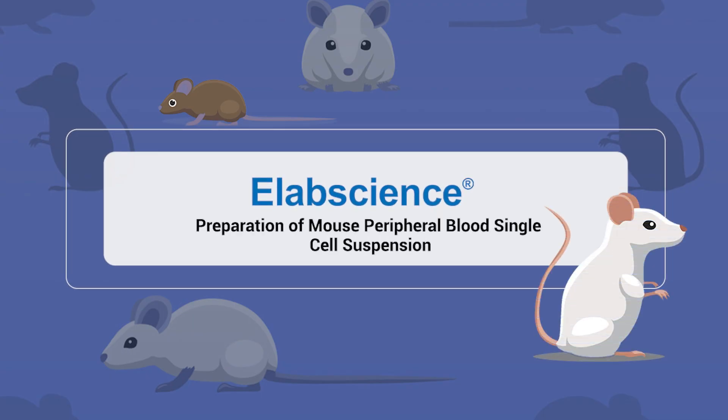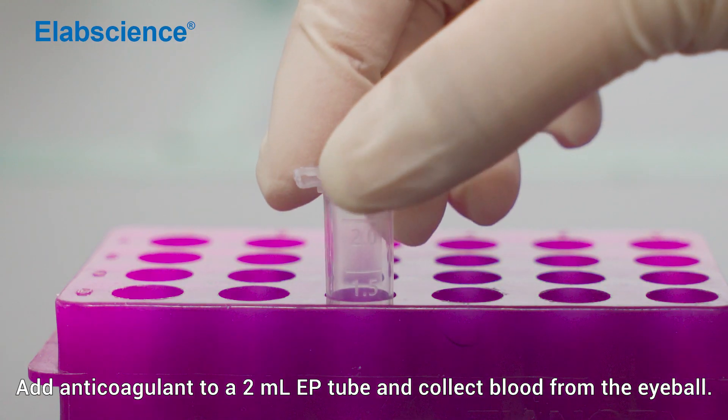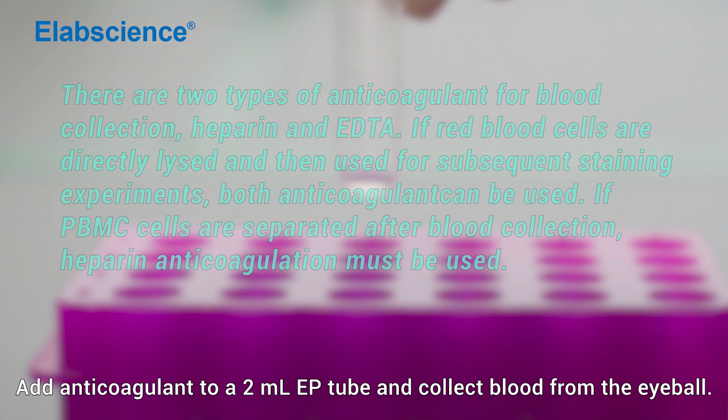Preparation of mouse peripheral blood single-cell suspension. Antibody incubation. Add anticoagulant to a 2 ml EP tube and collect blood from the eyeball.